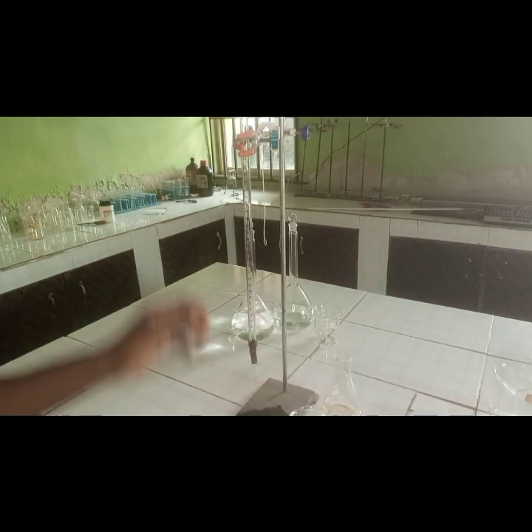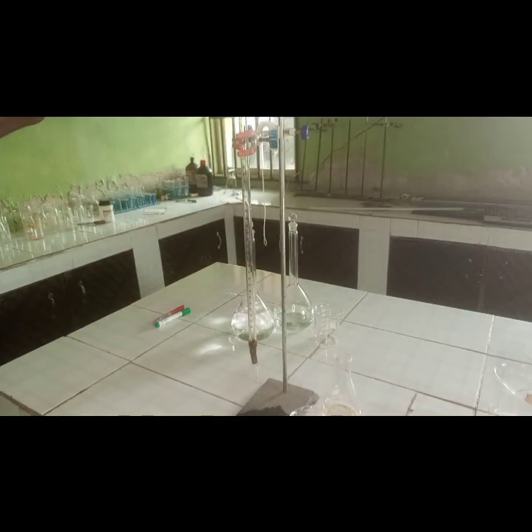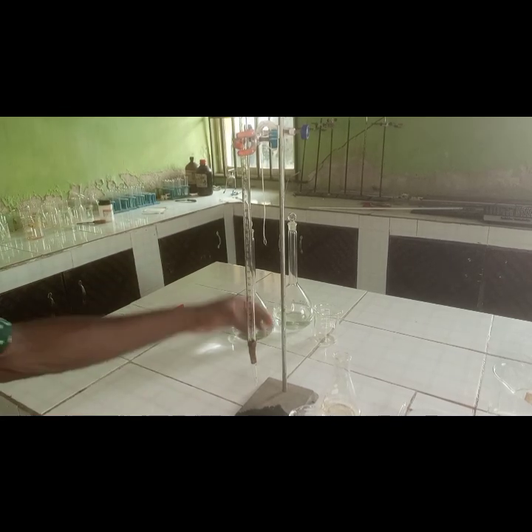Rinse the conical flask with water and rinse the pipette with the solution it's meant to contain. And at the same time, when filling the burette or after filling the burette before you start titration, you have to remove the funnel so that you won't keep titrating while the funnel tops it up for you. So that is it.